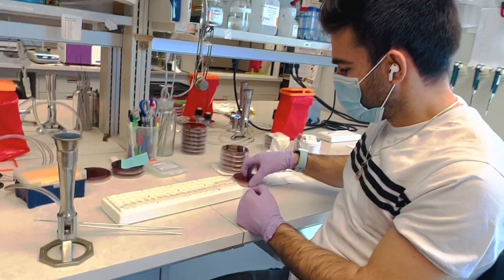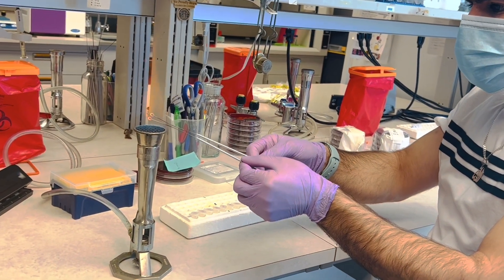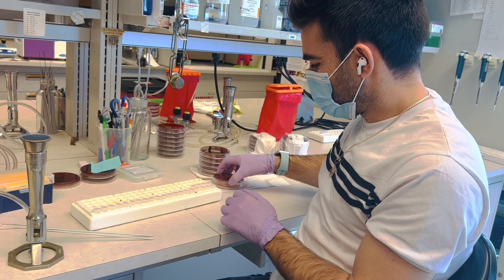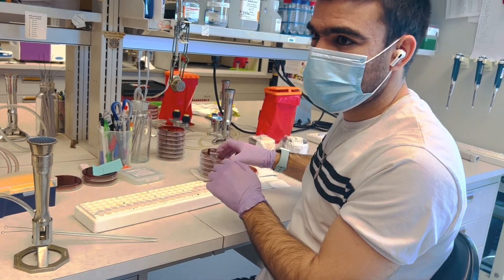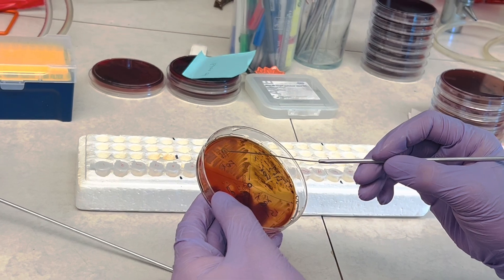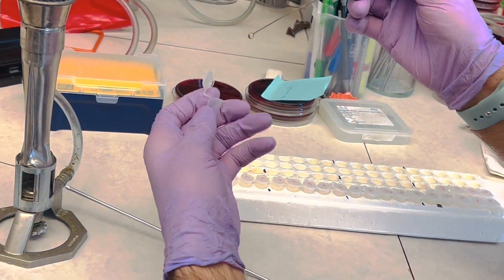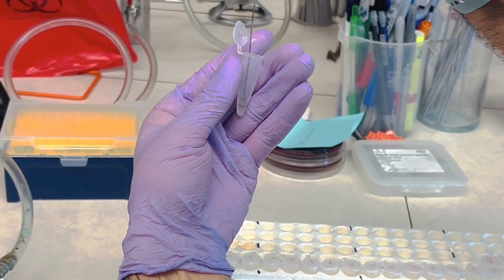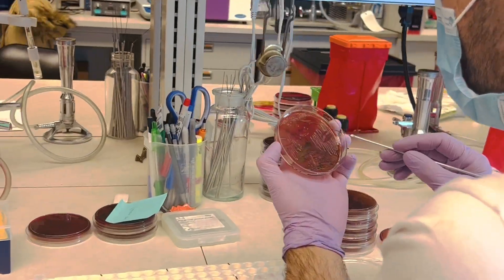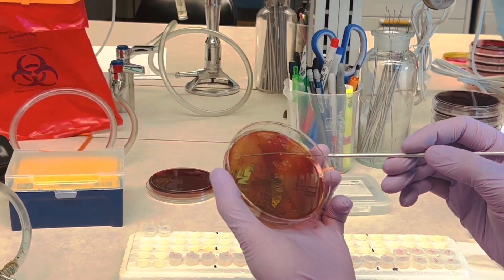Now you need to take a full loop of the isolates, making sure they are pure and refreshed on blood plates, to ensure they have expressed any genes that may have been dormant during the preservation time. I will take a full loop of the isolate and inoculate it into the culture tube.